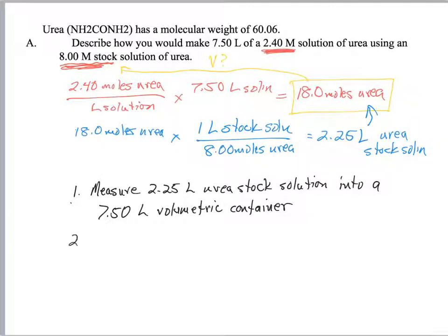And so all we have to do then is what is always our final step when we're making a molar solution. We add water to a final volume, in this case of 7.50 liters.